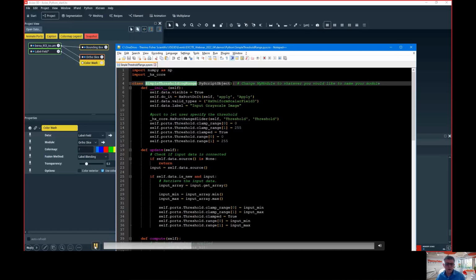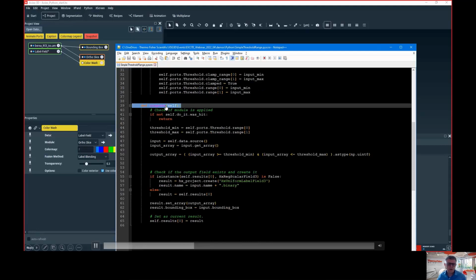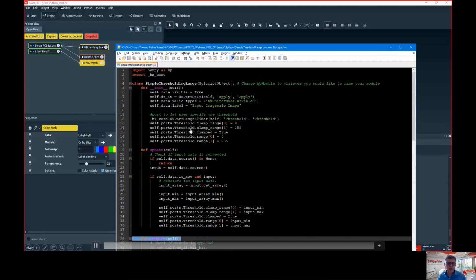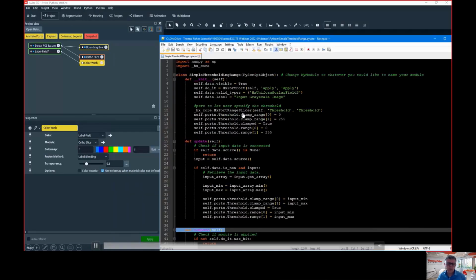But in a quick demo tutorial, I'm telling you, you see the 3 important methods you need to create. I can let you know where there are examples like this one. Okay, don't be scared.